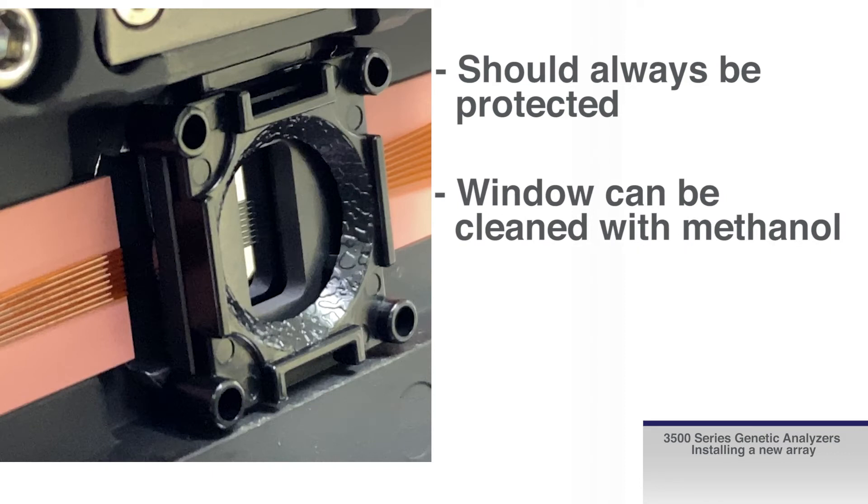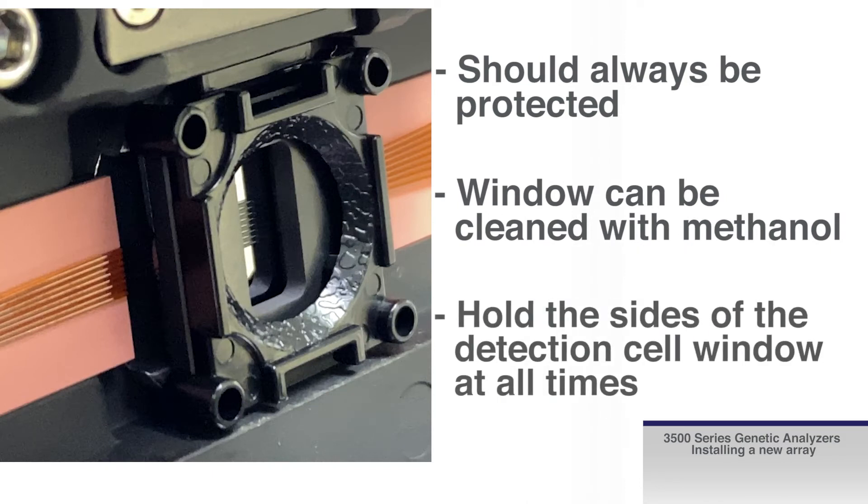If accidentally touched, the window can be cleaned with methanol. However, best practice is to hold the sides of the detection cell window at all times. Once the cover is removed, ensure it remains free of any residue or scratching.